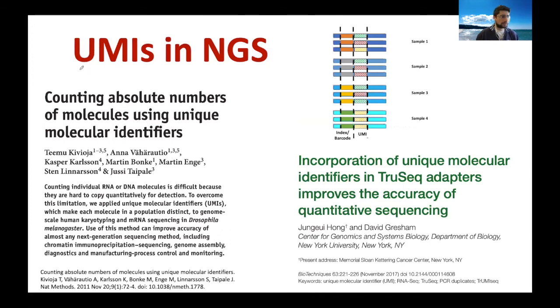All right, UMI. Okay, so again, it's different from sample barcodes. The difference between sample barcodes and UMI will be in the final test tomorrow, for sure. So please, if you have questions, just ask me about UMI and sample barcodes. I've seen from yesterday that in the mini quiz, some of you made mistakes between UMI and sample barcodes. I don't care about the results of the quiz. I just want you to understand the difference.